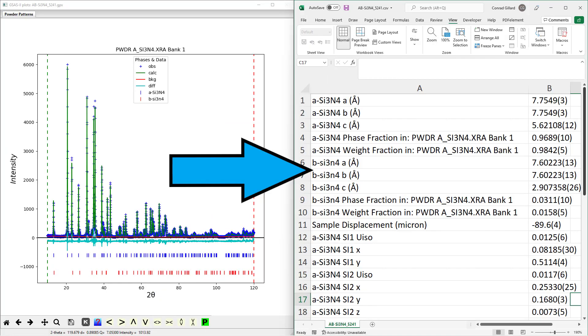In conclusion, this feature will dramatically reduce the time required to produce tables of parameters which can be used in a manuscript.